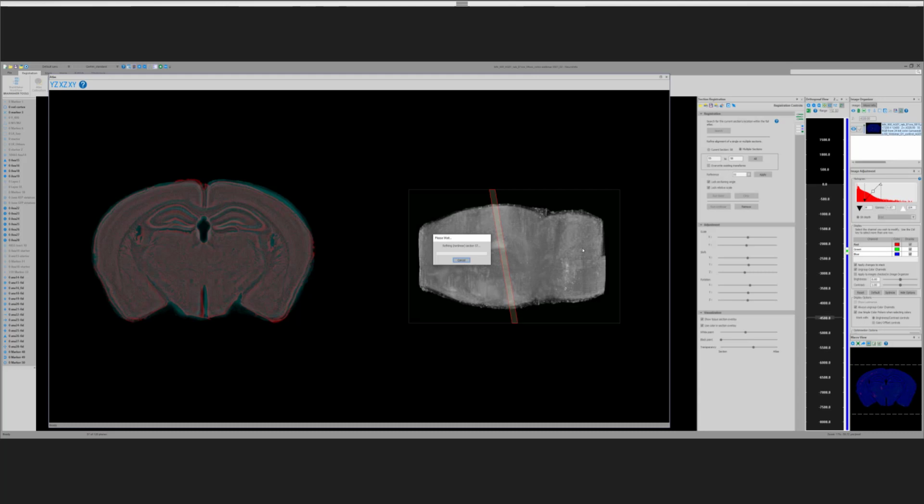A major limiting factor in all of this has to do with the imaging time. The imaging time really is what's rate limiting, because of how we image, and that's another webinar that we'll go through and describe. On average, we have 2 microscopes that we run pretty much all the time, and myself and Ron Poletsky, who works with me, the 2 of us can process about 4 to 5 brains a week. And we do a lot of other things at the same time, because a lot of that's just the computing time that it takes.